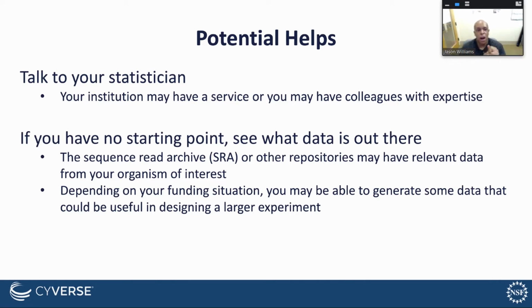If you know that the fold change of this particular gene or set of genes is within a certain range, a very tightly controlled, highly regulated molecule, it may not change very much under your experimental condition. Other things may change over quite a wide range. If you don't have any starting point, because no one's done this experiment or you don't know very much about the expression range, which is unfortunately going to be the case in a lot of circumstances, right? Human is very well studied.